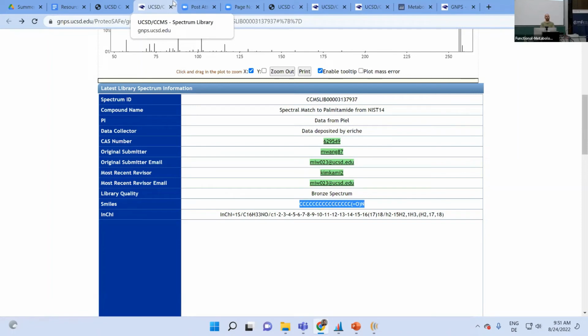I would base it on some ground truths you have. For example, if you have two authentic standards in there, then you know they're there, and you want to make sure that we identify them. In our case here, cocaine was actually an internal standard. I spiked in a mixture of a couple of drugs because we had them available as an authentic standard mix in the lab. So now if I hear that you found cocaine, I mean, it's funny too, but it's good because we know that this was an authentic standard we added. So now I want to make sure that my settings find that, and if not, I may want to tweak them till I find it.